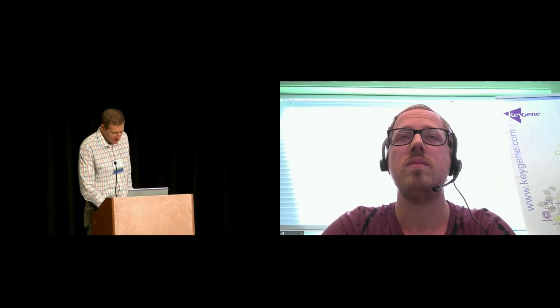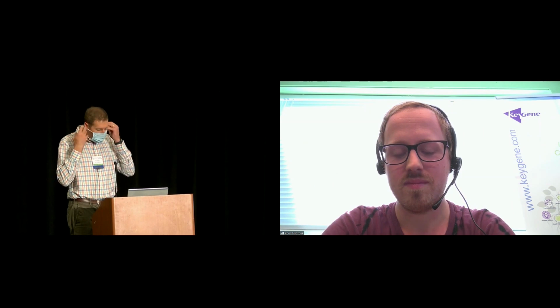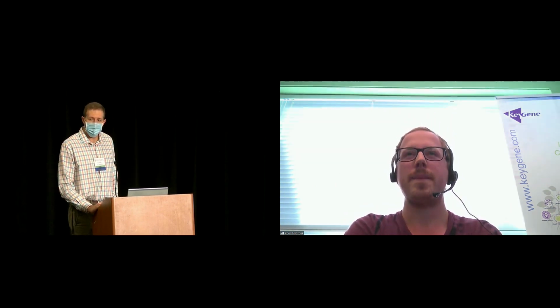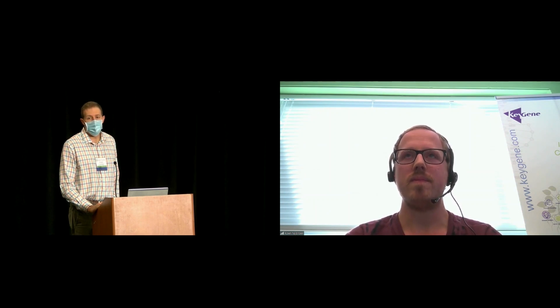Yeah, I've got another question here. Sorry, I was going to wait until after the next section, so I may be jumping the gun a little bit here, but the herbicide target gene thing made me think. So if you upload a genome that's not annotated, can you compare across genomes and try to align and find these genes that are annotated in another genome?